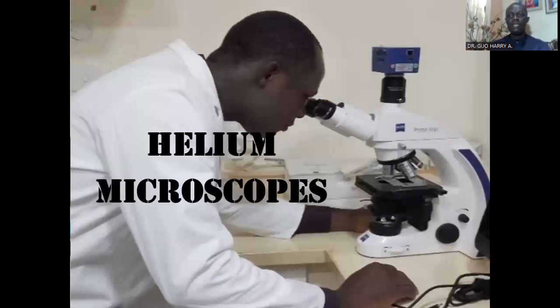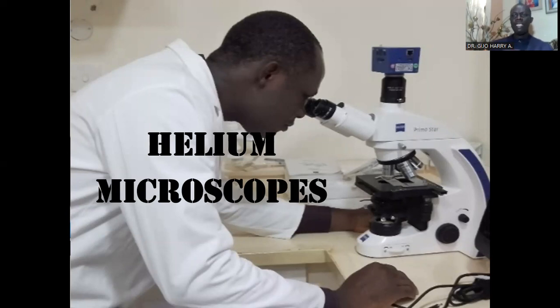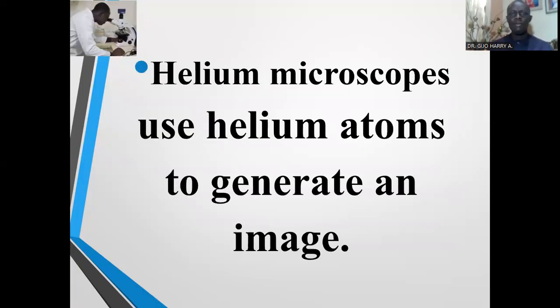Now I want to look at another type of microscope that uses a different type of media or source of illumination, and that's the helium microscope. We want to look at the helium microscopes. We have 2 types of these helium microscopes. First, what are helium microscopes?